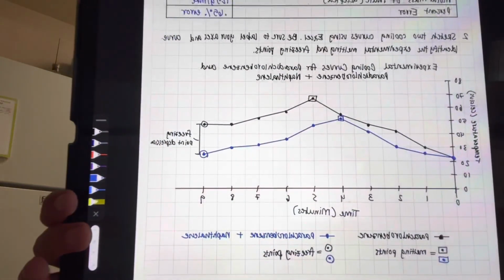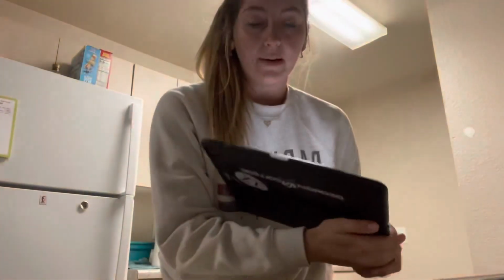And there you can see it. It will be in my lab notebook for a closer look, but I did put that into Excel and then copied what was shown. So thank you very much for this lab. I had a great experience with it. It was a tough one, a lot of calculations, but overall, it taught me a lot.